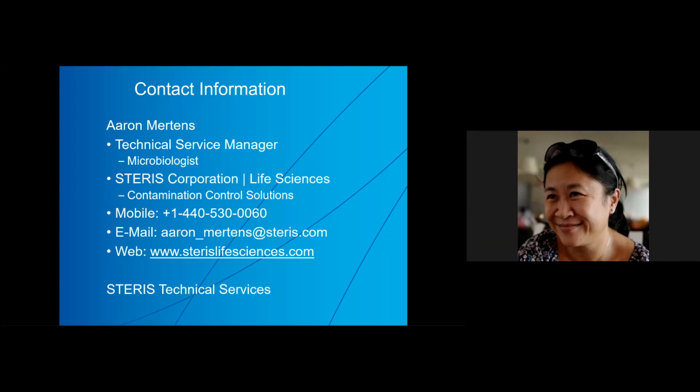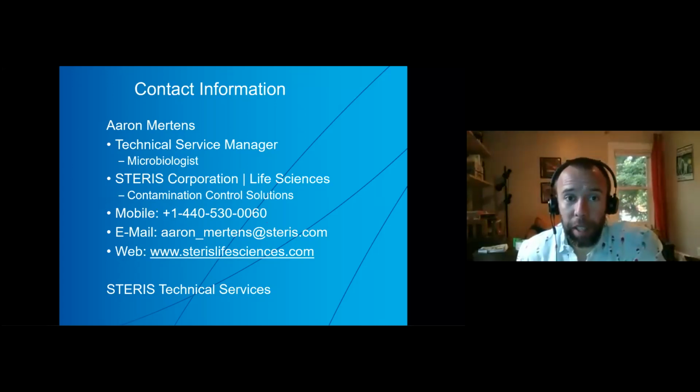Thank you. From Vinayak, how can we deal with the abrupt temperature drops of 5 to 10 seconds in any single thermocouple out of 24? Can we accept this? What are the probable causes? Well, it's hard to say exactly, but I think these drops are typically due to the presence of condensation.